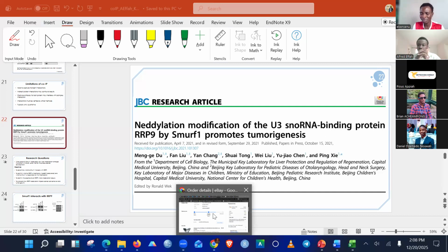Thanks for the answer. So for IP, you have to know your bait and your prey. Your main research question is to look at the interaction. That's the main research question we are looking at when we are doing IP: whether those two proteins that you are proposing or you've known are interacting with each other or not. So the kind of research question you are trying to answer will tell you which kind of research techniques to use. If you don't know the molecules, you can't develop antibodies against them. So you should characterize them before you confirm whether there is an interaction between them or not.